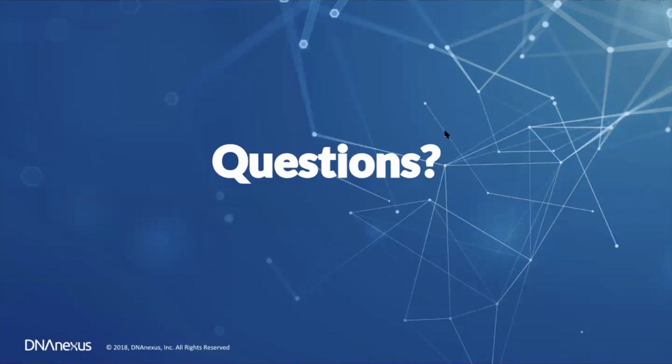All right, our next question is looking for some recommendations. We're wondering what you'd recommend to use to annotate CNVs, and if you'd recommend using other CNV callers to have more accurate batch results. So there's some kind of bedtools-like functionality built into CNVkit. You can read the documentation to see exactly what options are available. There's a lot of flexibility, more than I really want to talk about.